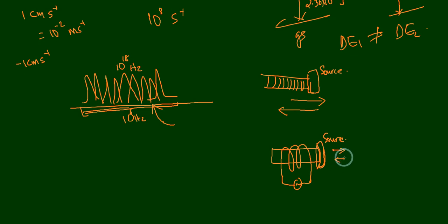So it will move back and forth, and you can see that when you are giving a particular AC frequency, how much it will move back and forth depends upon the AC frequency. Then at the edge, it is moving here, then moving backward and moving to here. Then it is coming back and comes to here. Then it is again moving back and comes to here.